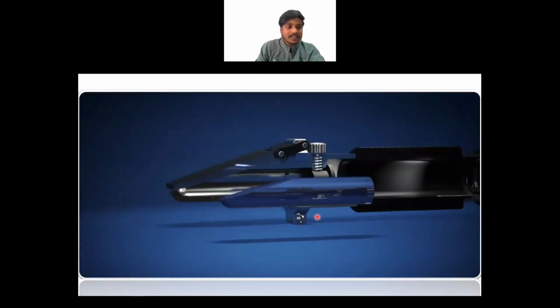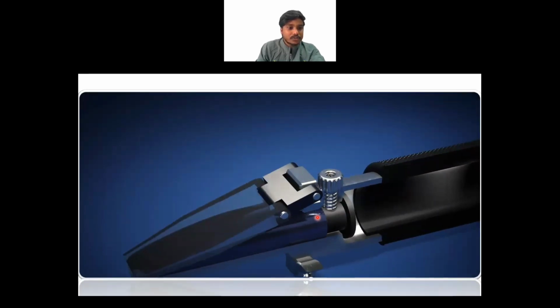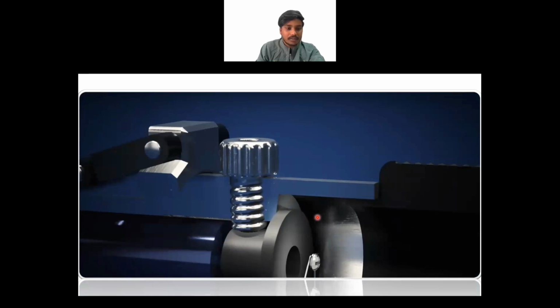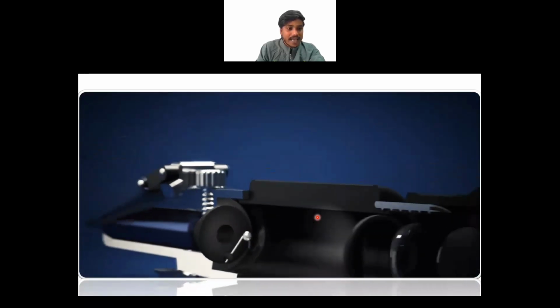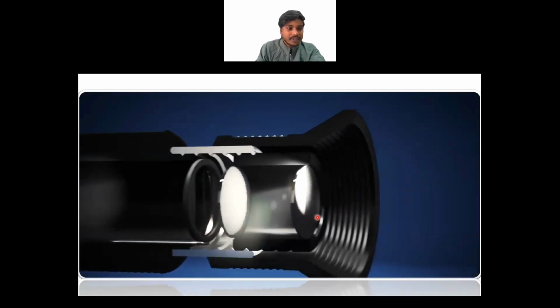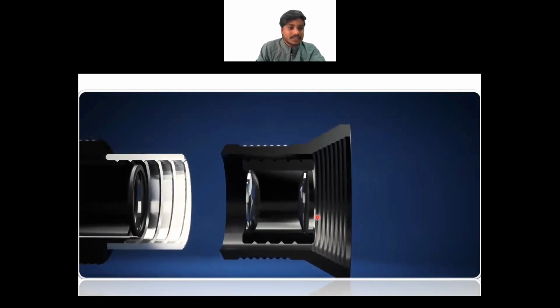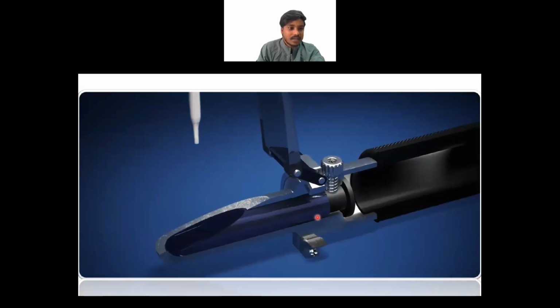A handheld refractometer is constructed as follows. In the front area, there is a prism. Above it is a movable cover that distributes the liquid to be tested on the prism. Behind the prism is the calibration screw. Behind that is the disc with a measurable scale. At the back is the eyepiece with two lenses in it for focus adjustment.